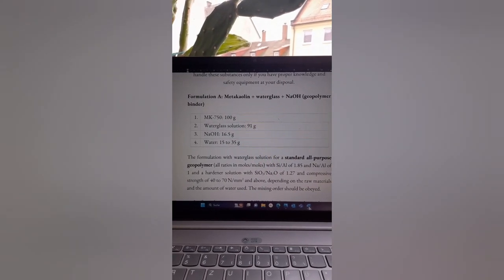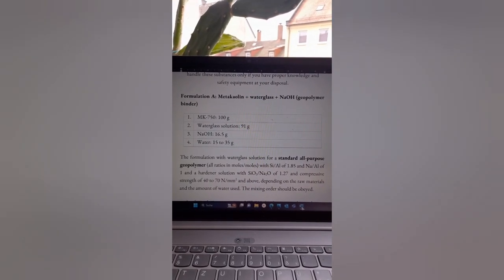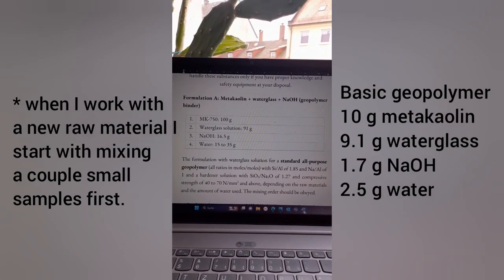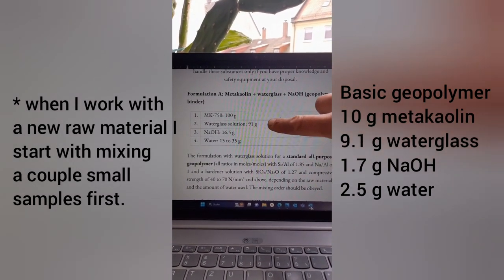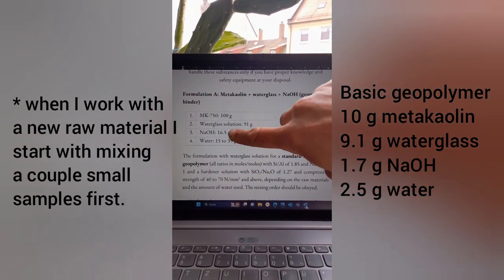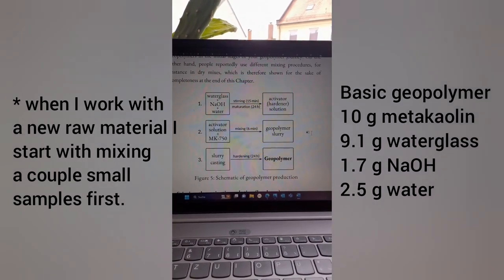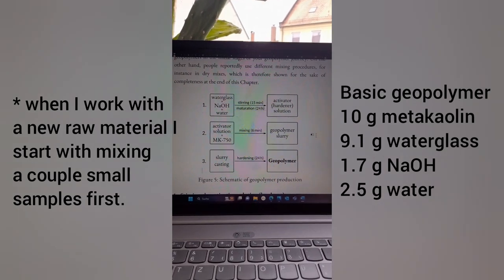My name is Patrick. This is a recipe from my new book about geopolymers. This is the basic recipe for a standard all-purpose water glass and metakaolin-based geopolymer. For 100 grams of metakaolin, we use 91 grams of water glass solution, 16.5 grams of sodium hydroxide, and around 25 grams of water.